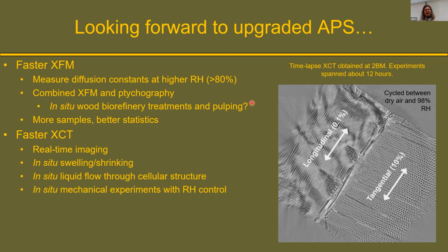Also looking forward to combining XFM with ptychography. A lot of the wood processing treatments, such as biorefining treatments, as well as pulping, involve inorganic acids and stuff.